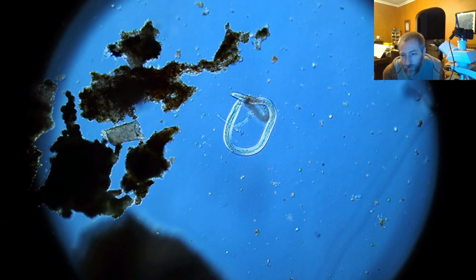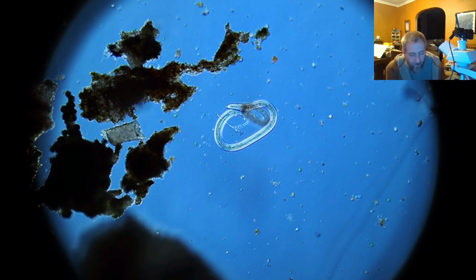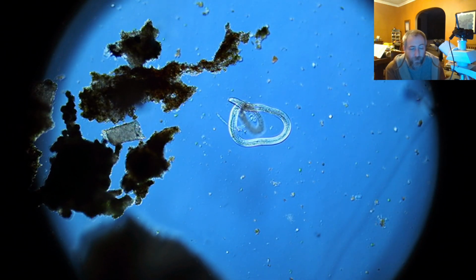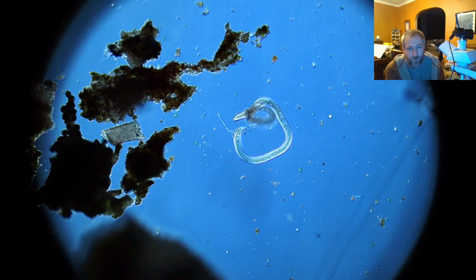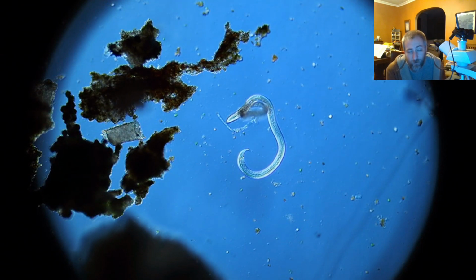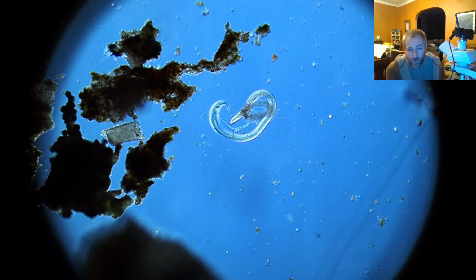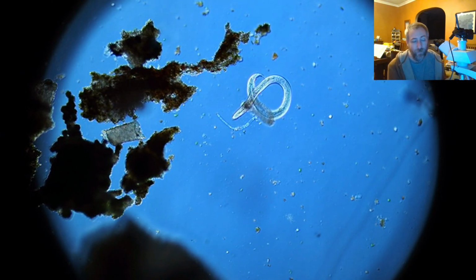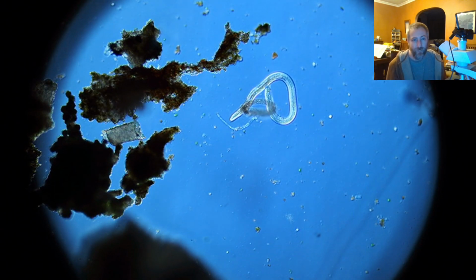Where did I find my sample? Sorry, Naziro. I went out looking for birds at Hawthorne Park, which is a local park here in Indiana, and I took a bunch of bird photos and, I don't know, sort of nature photos. And then at the end of it, I saw some sticks laying around, and I just picked them up from under a tree. And I recommend that if you're going to try to collect for water bears, you start with a dead tree branch that has some lichen on it. A lot of lichen. The more lichen, the better the likelihood that you'll find a water bear. You want dead sticks. I don't think you want to take a live stick off of a tree, although it's totally possible.